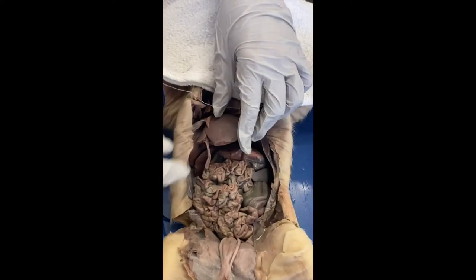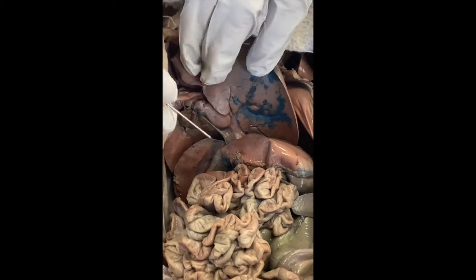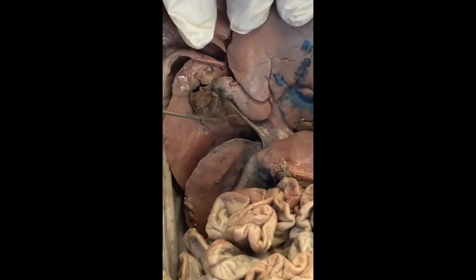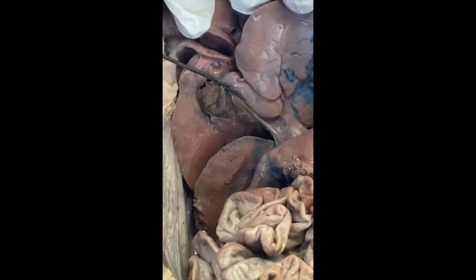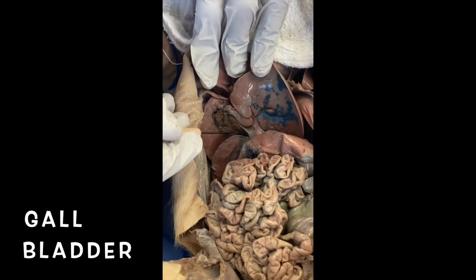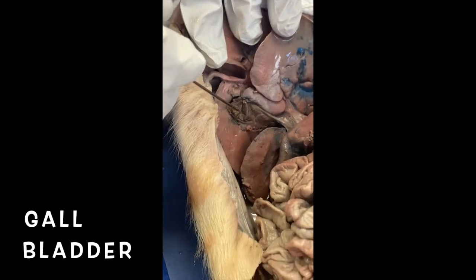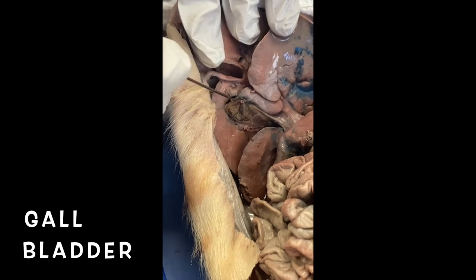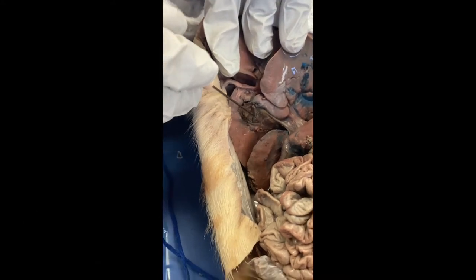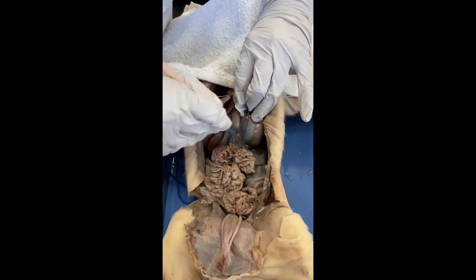Now, if I pull the liver up, this is one of the harder organs to see. I'm going to pull the liver up, and underneath is a bile duct here, D-U-C-T, and this is the gallbladder. I'm going to do the outline of the gallbladder here. A lot of people, I know I've had an aunt that has had to have the gallbladder removed. It really helps with breaking down fats. So sometimes when people have that removed, they may have issues eating fatty foods, but there is the gallbladder, and many people do live without it. This beautiful pouch right here, look at that. Very nice.